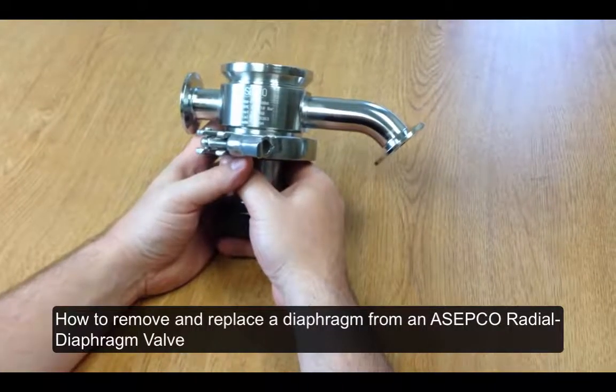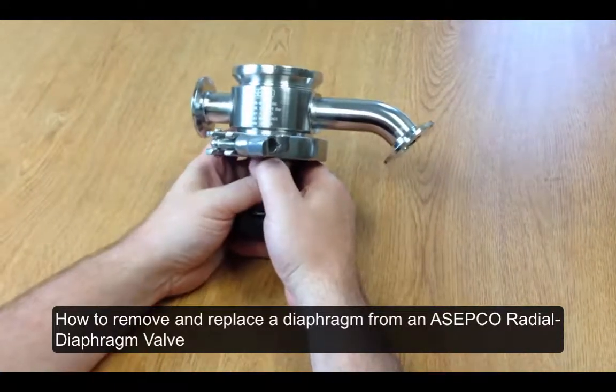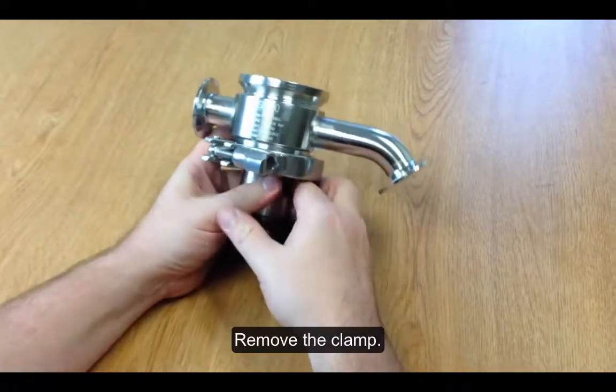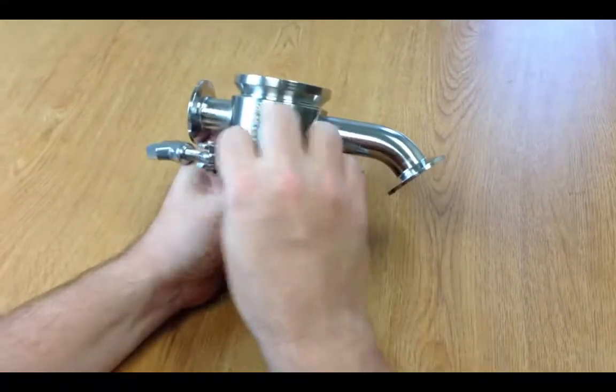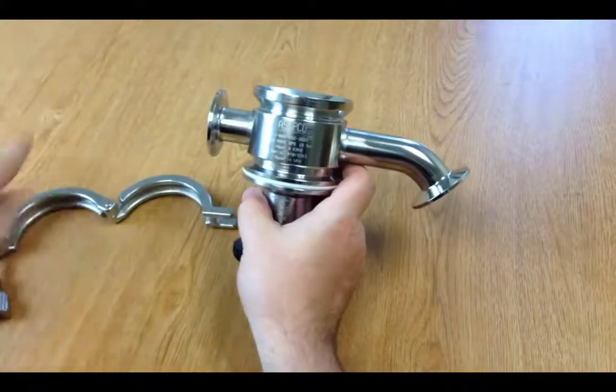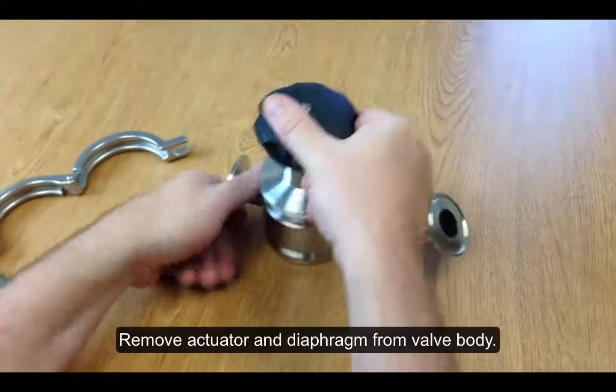Today I'm going to show you how easy it is to remove and replace the diaphragm from an Acepco radial diaphragm valve. First you're going to remove the clamp. Then you're going to remove the actuator and diaphragm from the valve body.